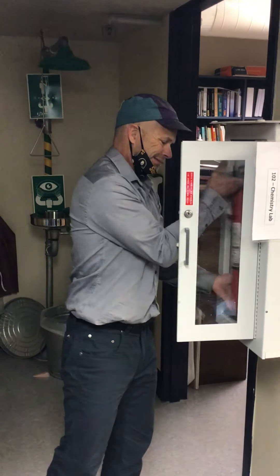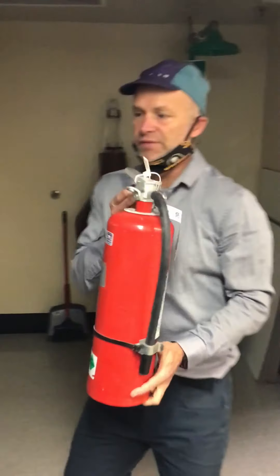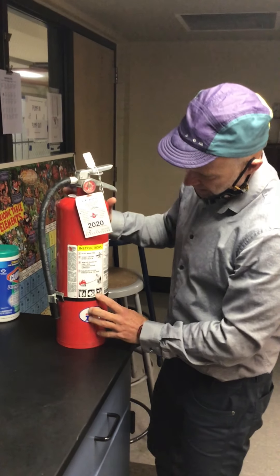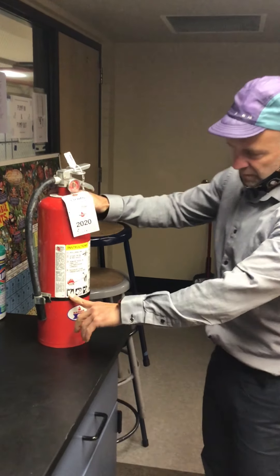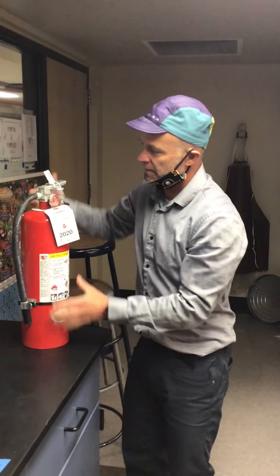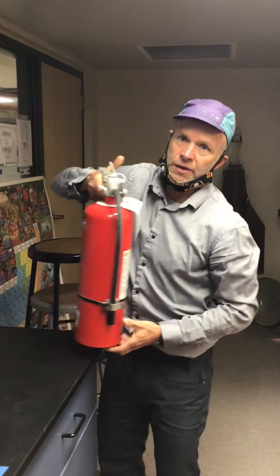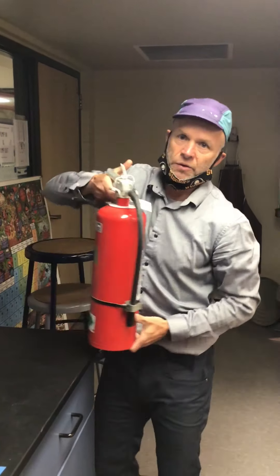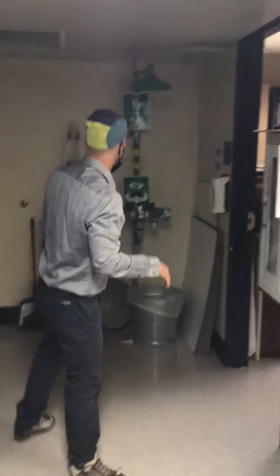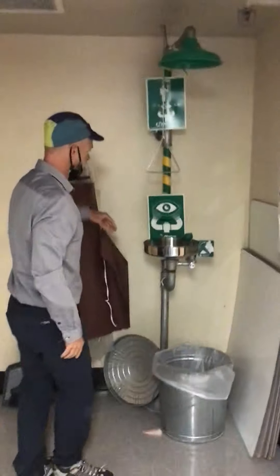In this corner we have a fire extinguisher. This is an ABC fire extinguisher as you saw in the video — ABC for flammables, liquids, and electrical fires. Let me handle this if something should happen. No one else should be touching the fire extinguisher.